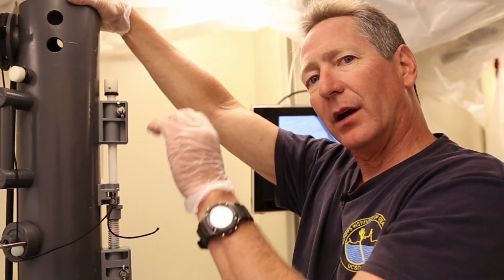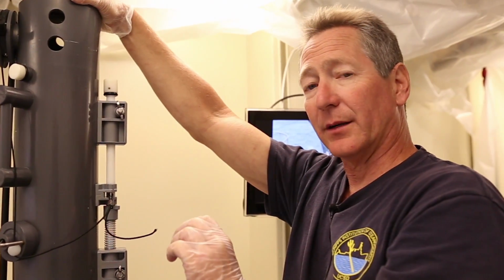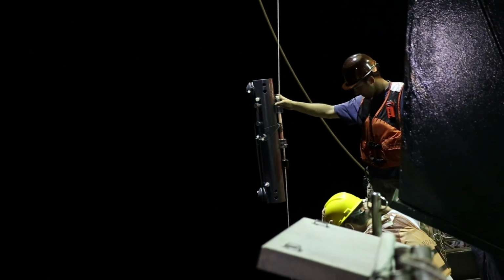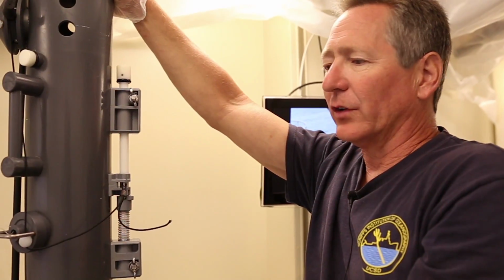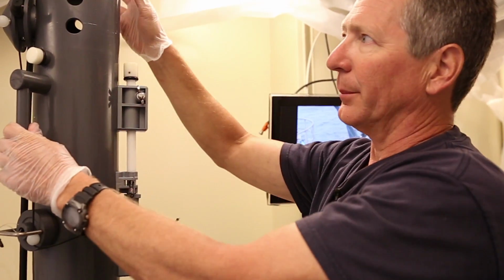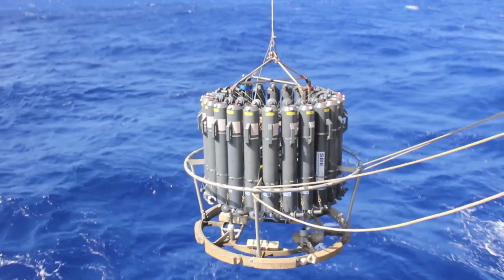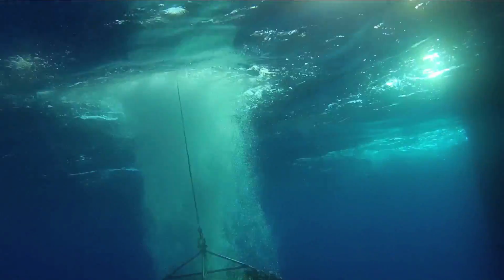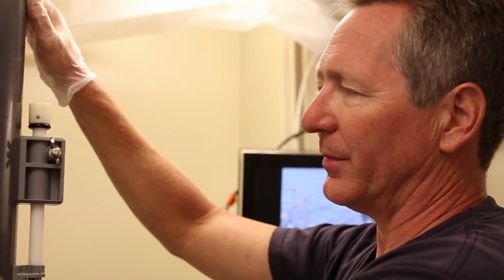The reason why we want this bottle closed when we send it over the side and into the water is that the very top surface of the water has a lot of contaminants in it, especially metals. We're on a metal ship, and there's metals that are always being eroded off that ship. Measuring iron in seawater is very important, and we're on this iron ship. It's a ship made of steel. So we don't want that contamination in our bottle. So we use this special bottle. It's a little bit more difficult to use than the 24 bottles on the rosette outside, but it stays clean as it goes through the air-water interface and the upper 30 feet of the ocean.